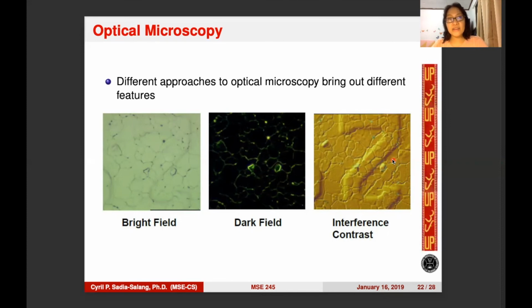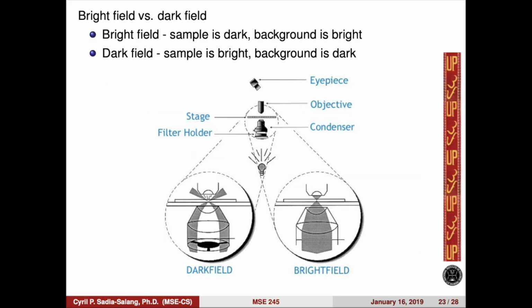And step heights as small as 3 nanometers can be observed, making this technique suitable for measurements of planarity of the wafer surface, and for etch pit studies.